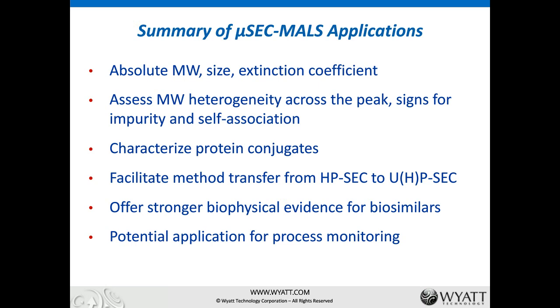And by actually getting more information from those light scattering detectors, we can transfer methods from one platform to the other much easier. The additional information also offers stronger biophysical evidence for biosimilar characterization. The much reduced analysis time may also open doors for new applications, such as the potential method for process monitoring.